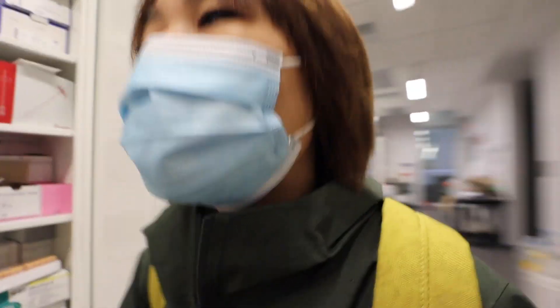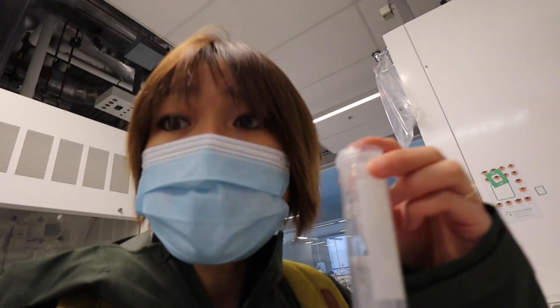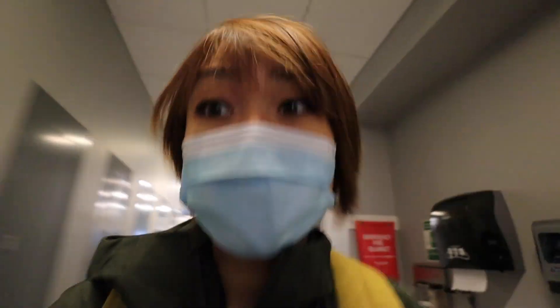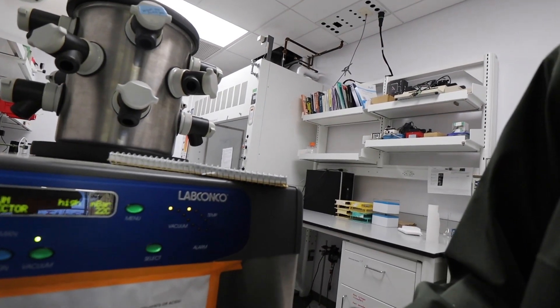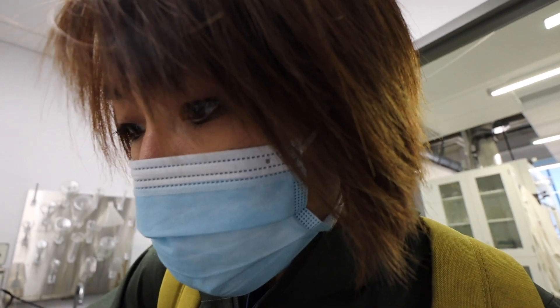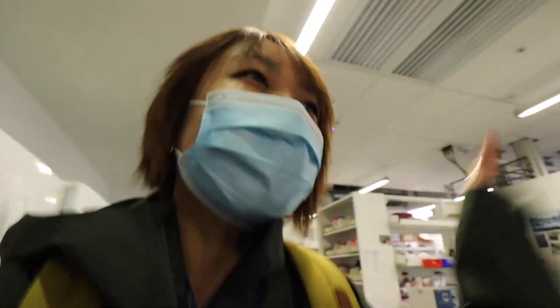Yesterday I asked Ho Han because he was here — yeah, these are my lyophilized samples from Friday. Now I'm gonna go turn on the lyophilizer in the other lab. Can you tell how very much I don't want to be here right now? Anyways, this should be pretty quick. I'm just gonna turn it on, sign this, and wait. Okay, should be fine. Let's go grab my samples and in and out we go.